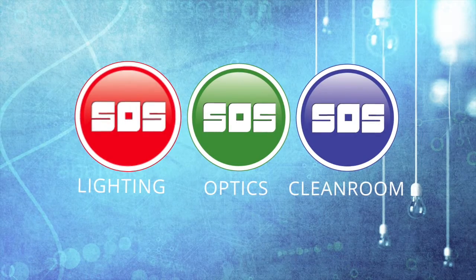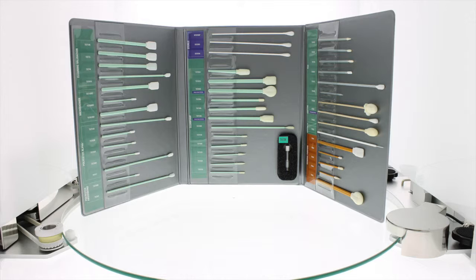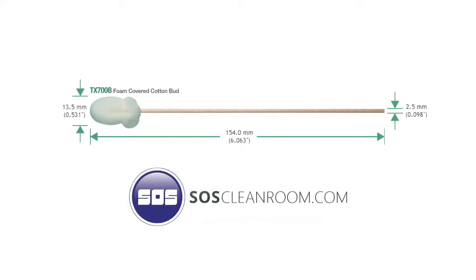Welcome to this SOS product spotlight. This video is one in a series featuring Texwipe swabs. At the end of this video there will be a direct link to this swab's product page on SOSCleanroom.com. This video features the TX700B foam covered cotton bud cleanroom swab from ITW Texwipe.